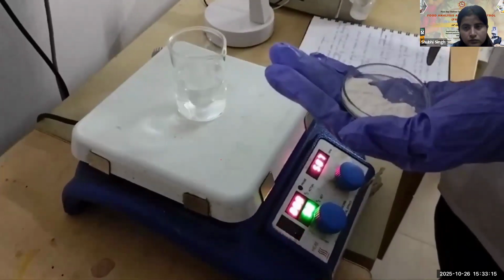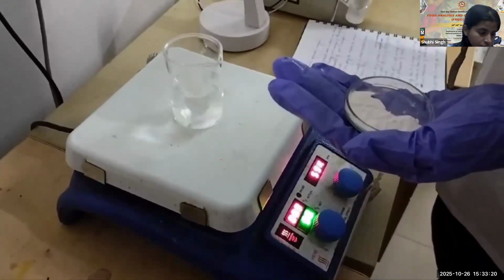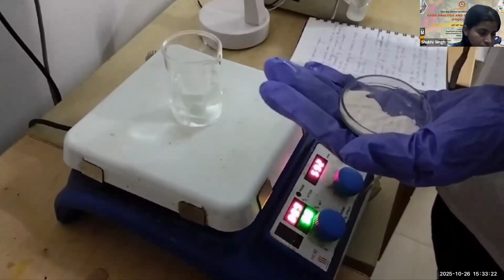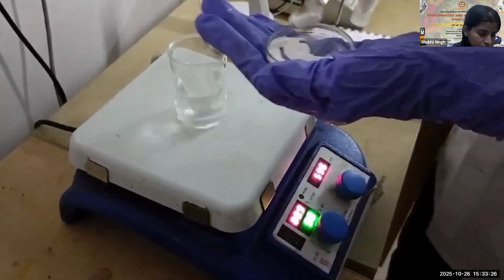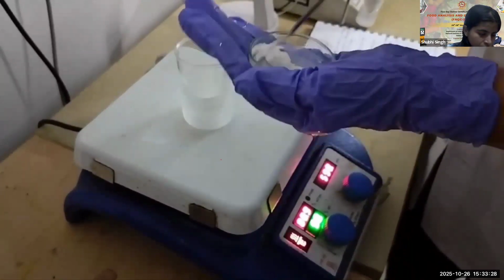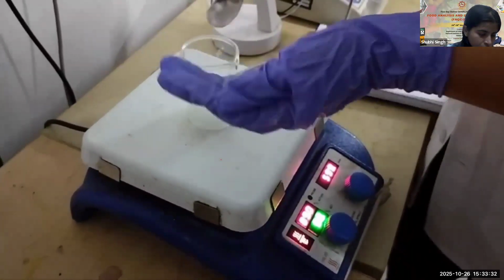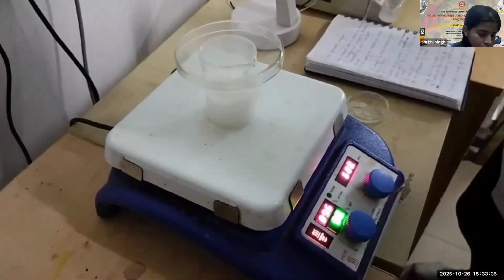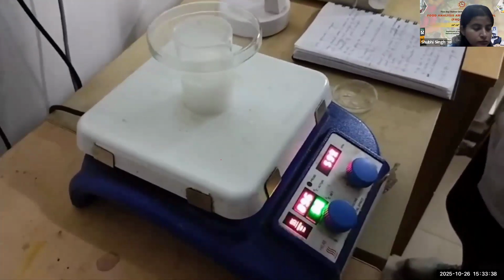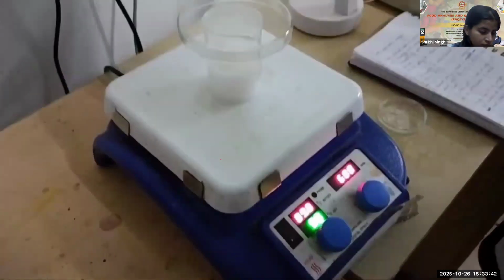Around 2.5 grams of starch is slowly mixed with 47.5 ml of distilled water in a beaker. The whole solution is kept at a temperature of 90 degrees Celsius for the gelatinization of starch.